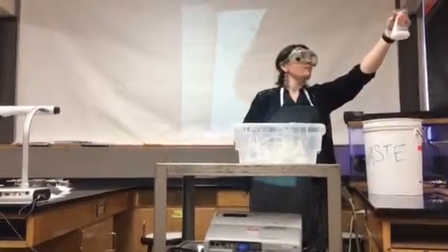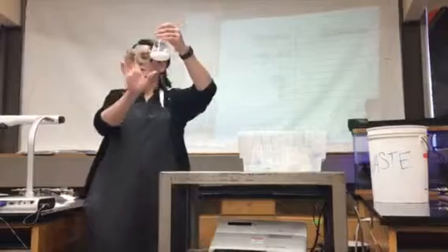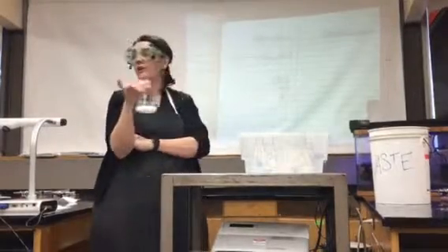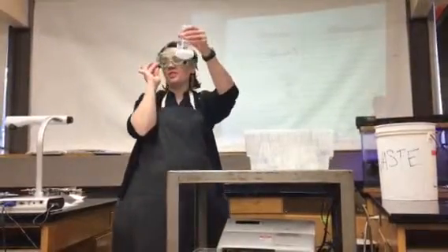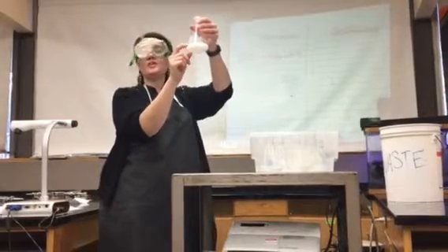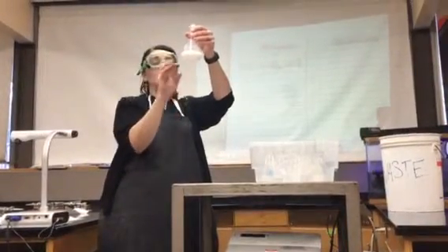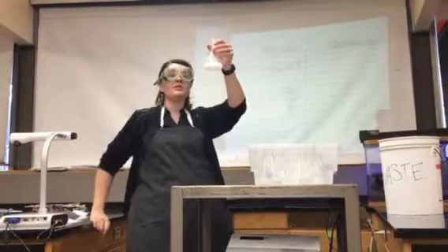Here's an important thing I'm telling you right now. This thing you just saw is called a precipitation reaction. What does precipitation mean? Rain falling. So the reason this is called a precipitation reaction is because the reaction forms a solid. There's little heavy chunks in here. And if I let this sit long enough, they're going to fall to the bottom, like rain would fall. Does that make sense? So when a thick, chunky substance forms from two liquids, that's called a precipitation reaction.